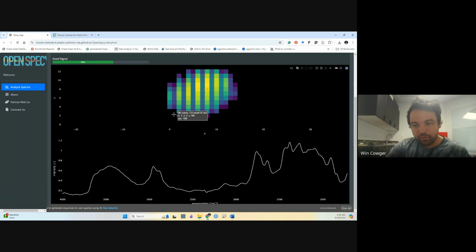Is there a percent value that we should be concerned about for a bad or good signal? Oh, interesting. A percent value that we should be concerned about. I'm not totally sure about what the question is, Julian. If you want to unmute and ask.